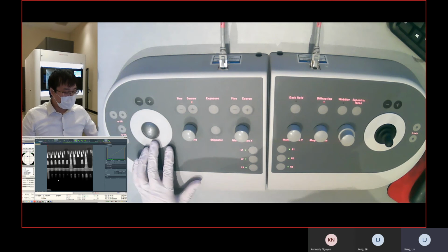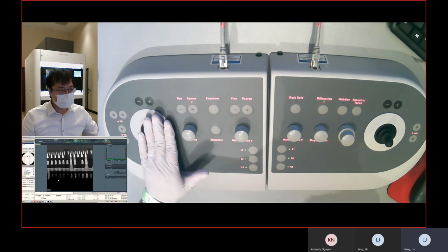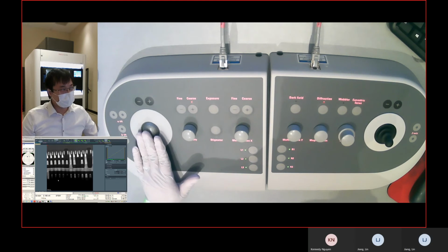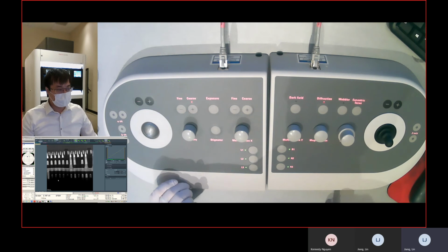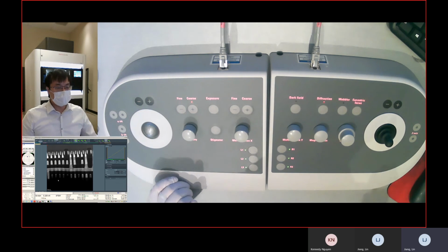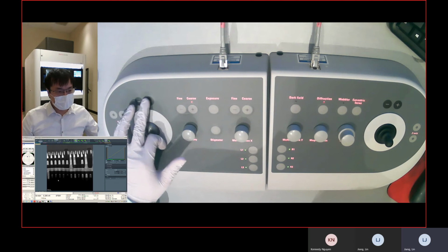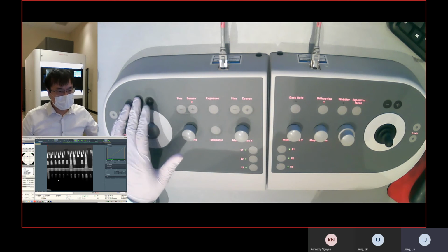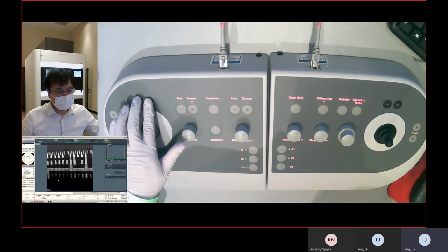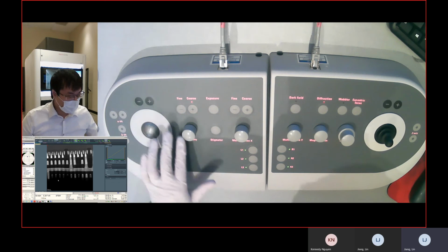So we also have beam shift visible. You can shift your beam to do image shift. When you shift, you see the sample moving a little bit. This is the image shift. You don't actually move your stage, you move your beam. And this is a button to change the step size of how fast you want to move your beam.